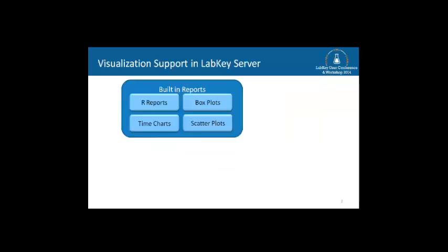So, visualization support in LabKey Server. We have the standard, and this is not an exhaustive list, what we call built-in reports. These are reports that are built into the server. They're built into our grids, built into our data views, managed views. These are the popular ones. Of course, our R reports are very popular. A lot of people are able to build very powerful visualizations.